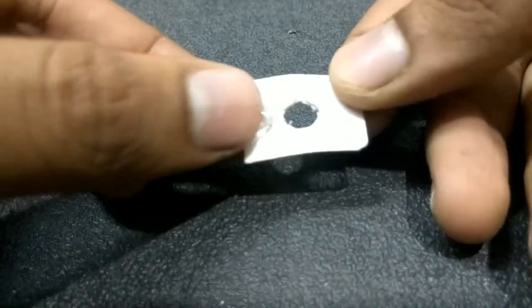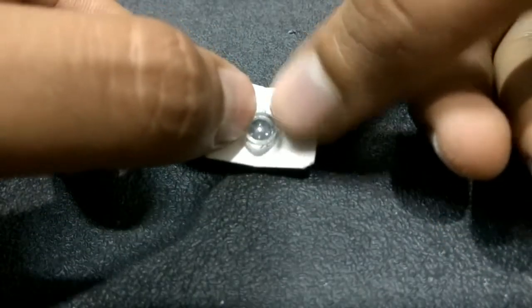Now cut a hole on the card exactly the size of the lens so that it can easily fit in.